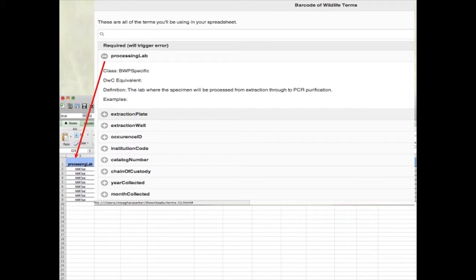When your spreadsheet goes through the validation step on its way to the FIMS, this term will be checked to make sure it contains one of the accepted BWP values. This is one example of the validation rules that we have constructed as part of our data quality assurance. If you are constructing your FIMS spreadsheet with data taken from repository specimens, please do your best to match your repository's terms with these BWP definitions and then fill the sheet accordingly.